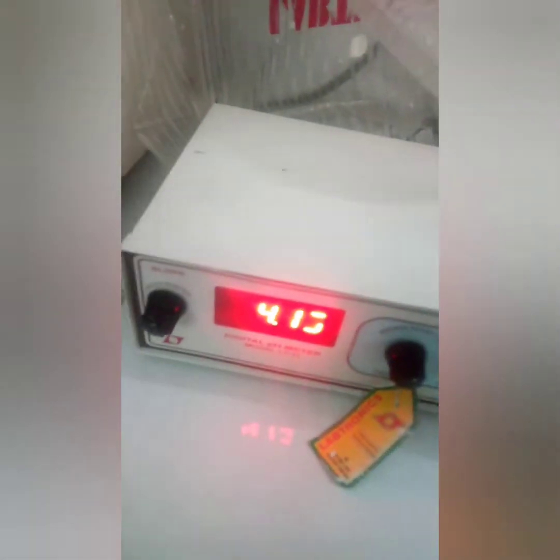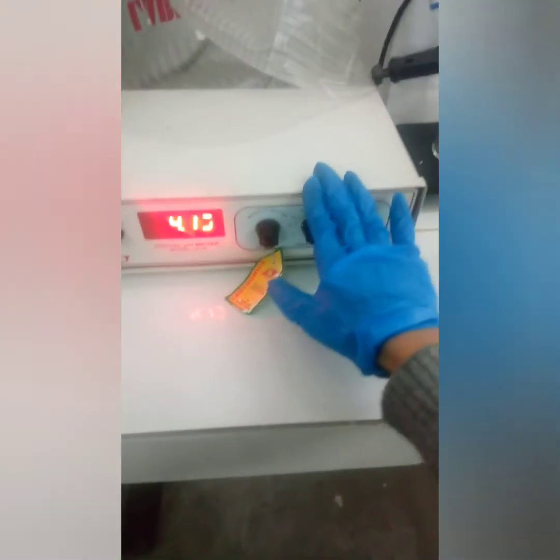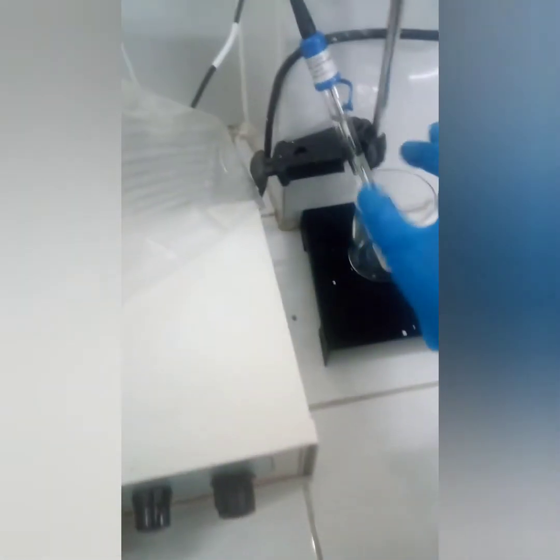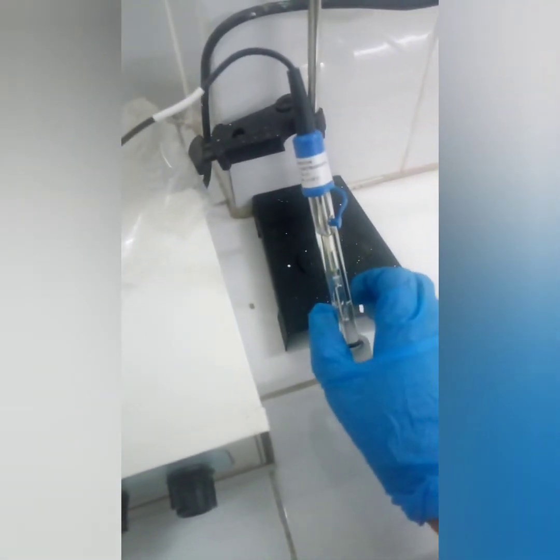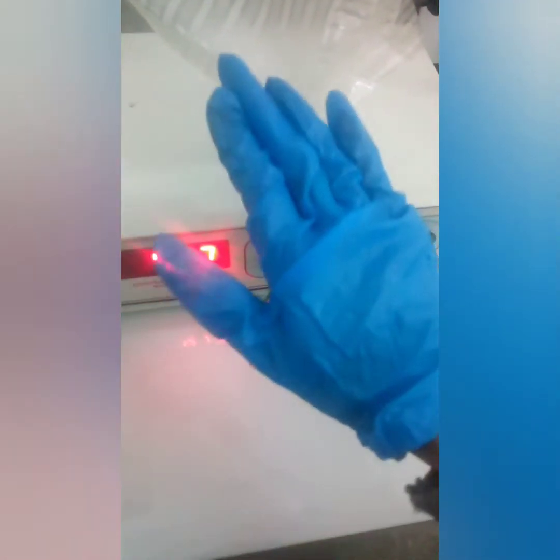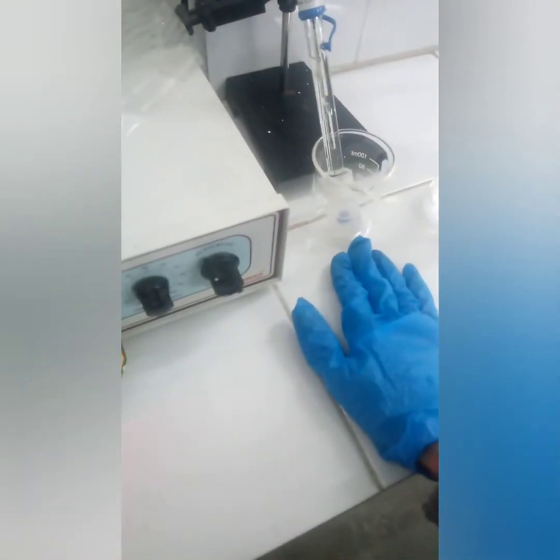So girls, this is another instrument that we are using in this experiment. This is the pH meter. For measuring the pH of the buffer, we will use this instrument. Now before using this pH meter, we need to calibrate. So we need to correlate the pH of this instrument with the standard pH.